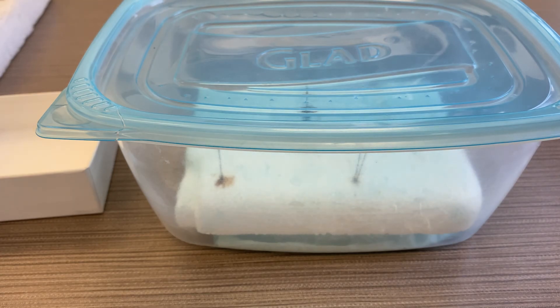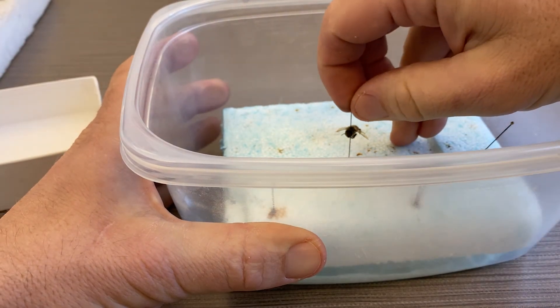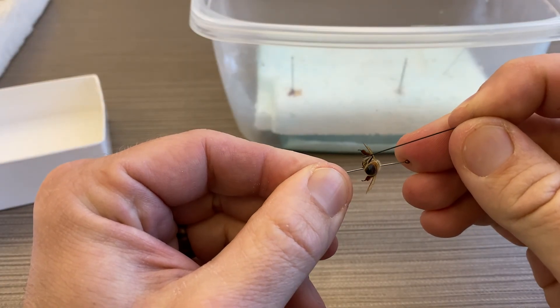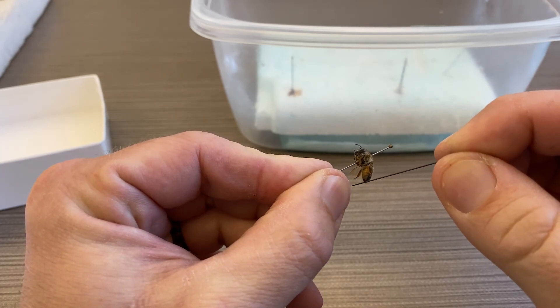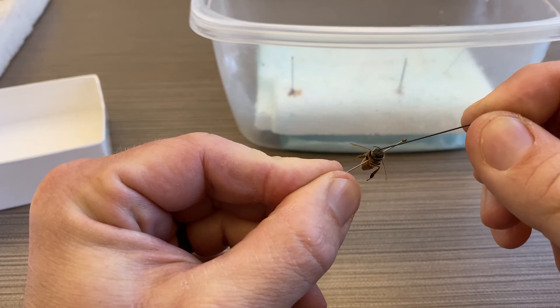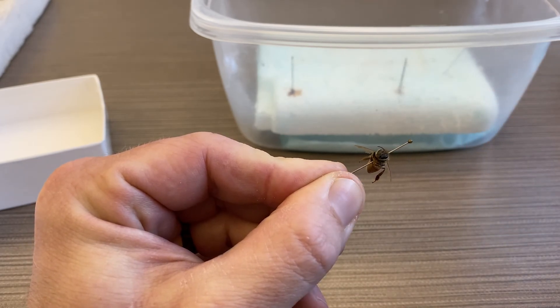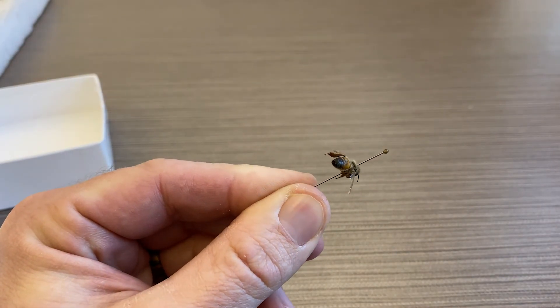So if we pull this one out, you can see I can now move the legs without breaking them, I can move the abdomen, I can even move the antennae. All the joints have softened up, and now it's time to spread it out.